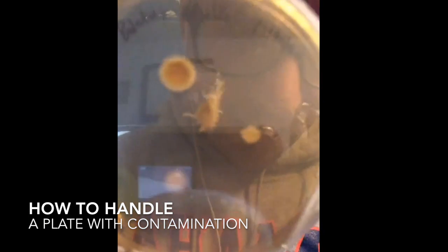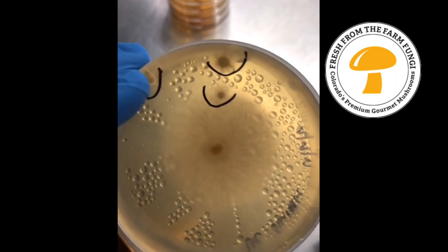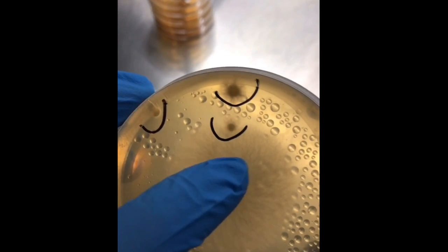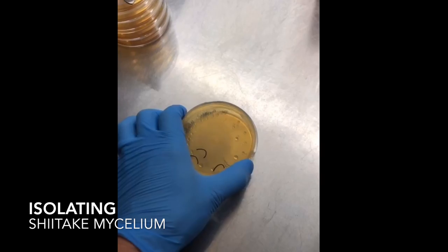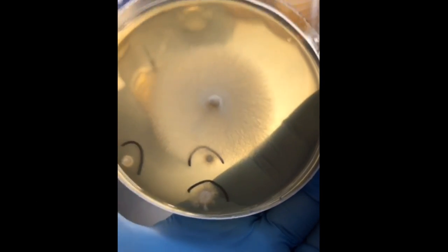To save a plate with contamination, first you want to identify the contamination. This looks like possibly some spores that sprouted or some mold growing on the plate, so I'll just mark this so that I don't work in this area when I'm isolating the clean mycelium.